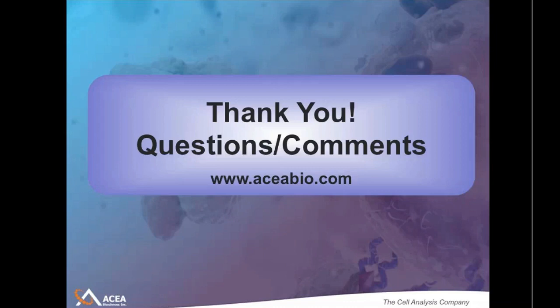However, I would say that as we've added more fluorochromes and more lasers to our repertoire, and as the engineering with the instruments themselves has evolved, as well as the software and hardware that process the data, and even the improvements in dynamic range and scaling, we should really allow for a little more leeway in handling large percentages in the compensation matrix. And I mentioned briefly during the presentation about data spreading.